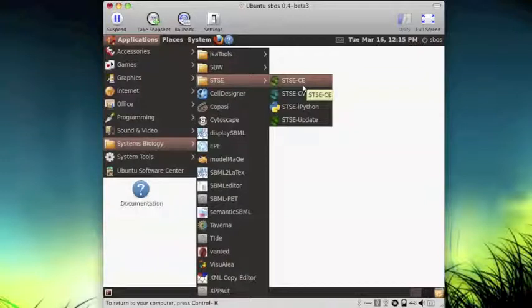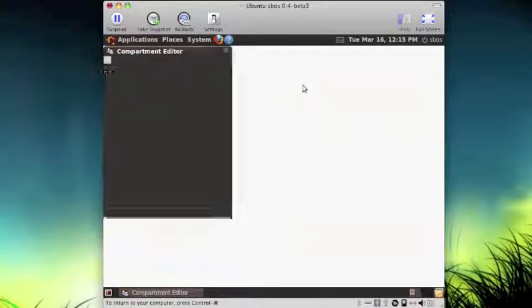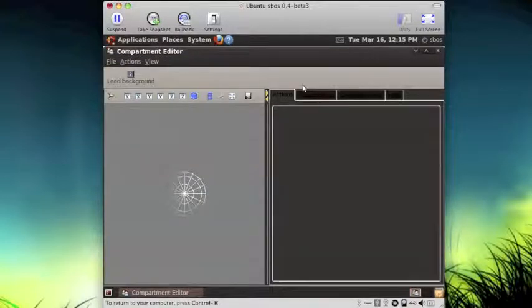So I'm going to start the application right now. Now the application is started, and we see the main window of the application. On the left we see an OpenGL component which allows you to play a little bit with the display. Here we are using a kind of viewer which is 2D, so it's adjusted to play with photos.